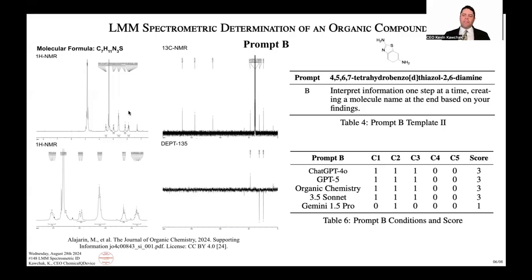So with this one, I think that's where it kind of got messed up. I don't think they got their footing with this question, because if we look at the structure here, it has this diamino, and that's probably this peak at 4.9. If it's not that, then it's this one at 3 point something. But the authors didn't label it, and it wasn't integrated. So that was a tricky part.